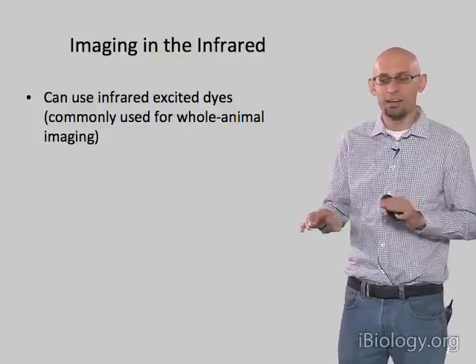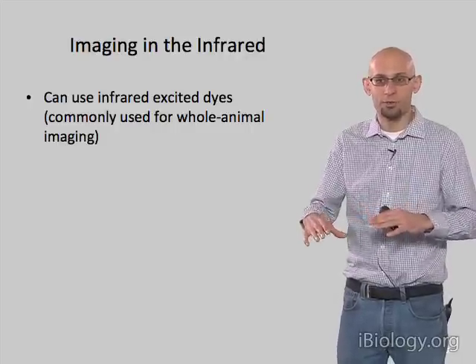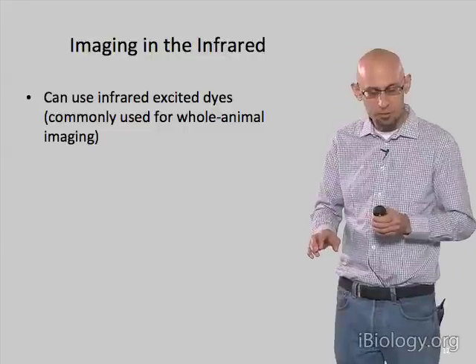You take an anesthetized mouse, inject it with one of these dyes that will bind to a tumor, and then you put it in a device where you just look through the skin of the mouse at the whole animal. And these work very well for that approach.